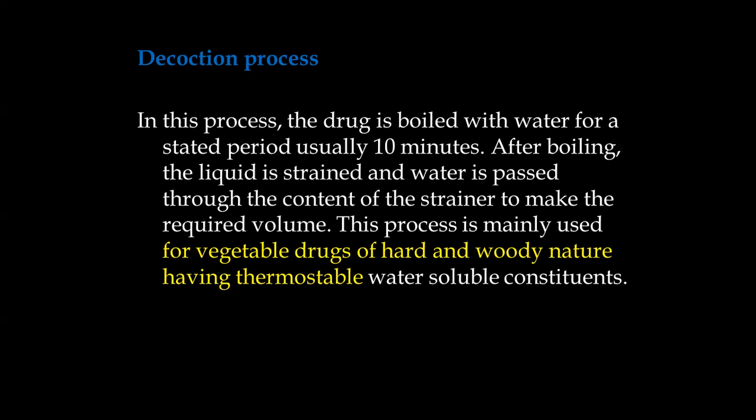The apparatus used in the infusion preparation, the same apparatus you can use here. The nature of the raw material and the time duration, only these two are the differences between the infusion and decoction processes.